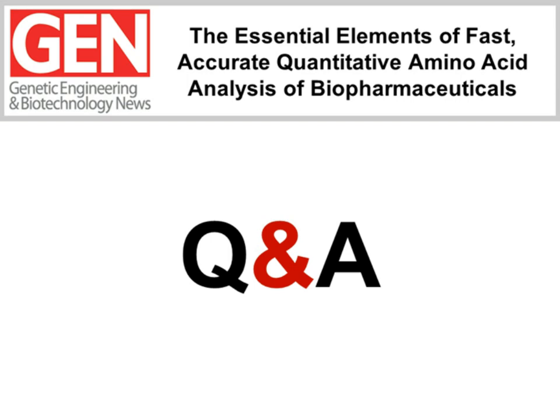Thank you, John. The comparison to other techniques is a very large question, of course. In general, where we have been able to run the same samples by our method and by one of the alternative amino acid analysis techniques, we generally fall within 1 or 2% for all the values of all the amino acids.